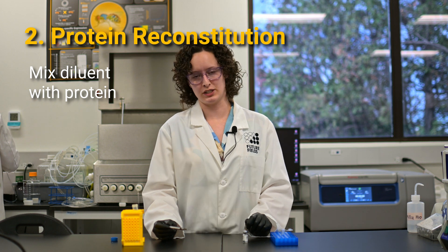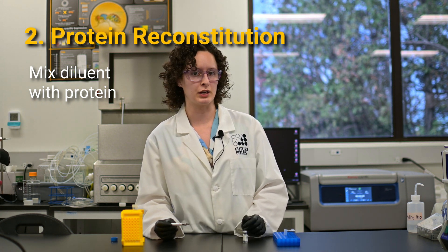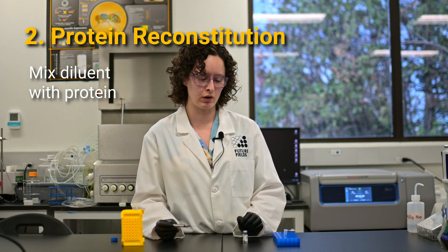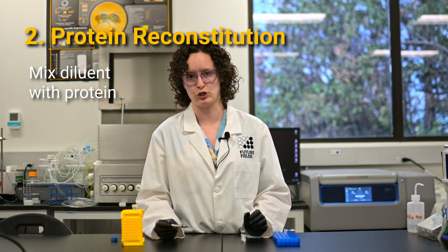Follow the product-specific instructions for reconstitution. Some products will require a longer incubation time or specific mixing protocols. For most products, gently swirling the vial while avoiding foam is sufficient.